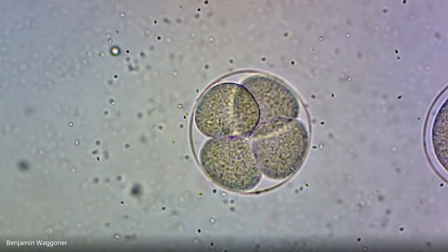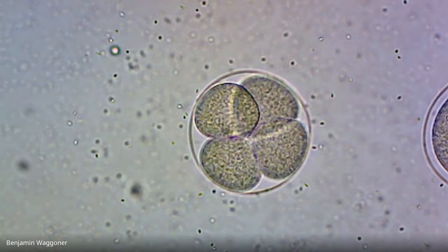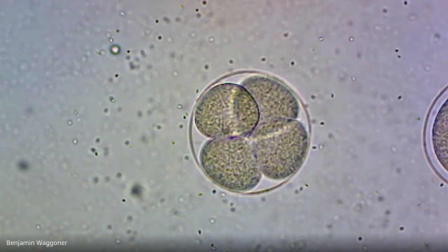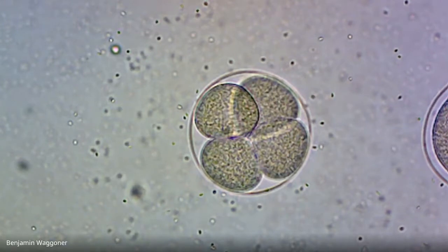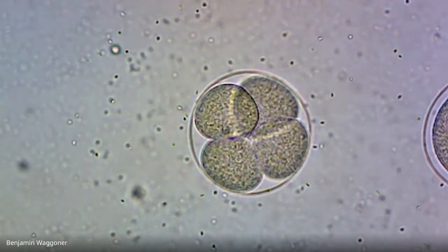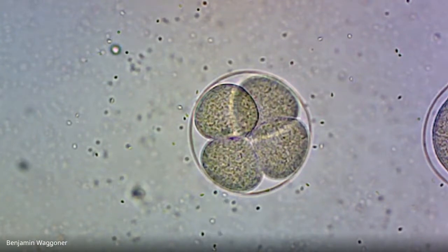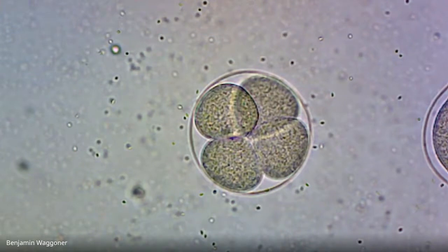Okay, here's what I've done. I took the rest of the eggs and I fertilized them with pretty dilute sperm, I hope, in a couple of large dishes. Each one holds about 1.5 liters, and I'm going to leave them overnight. And one's a control, and one of them has had some nickel added, and nickel is known to be embryotoxic. We added a very small concentration of nickel, but I'm going to check these out tomorrow morning when hopefully you're all here, and I'm going to check them again tomorrow afternoon, and we'll see if we can detect any effect.